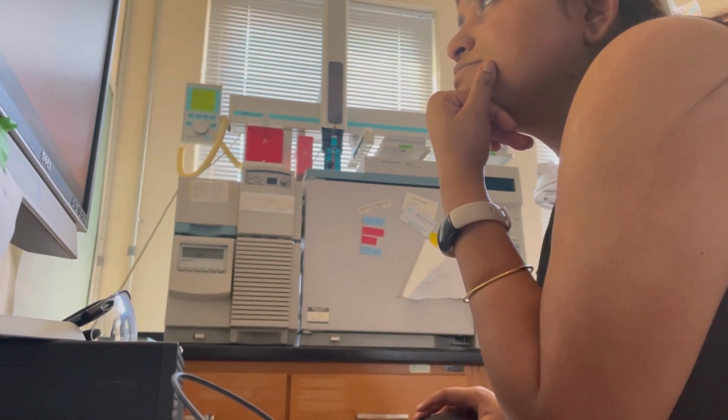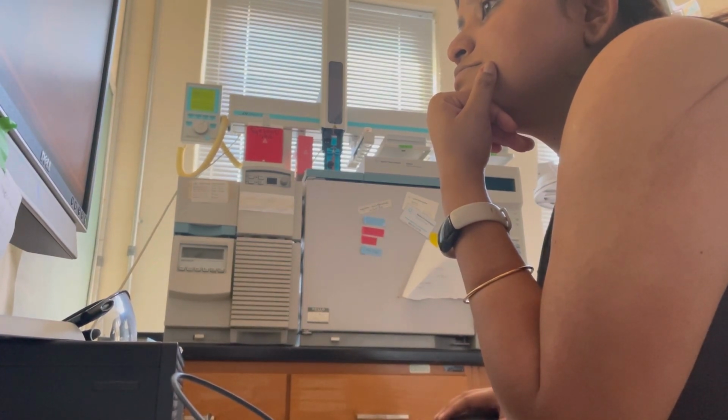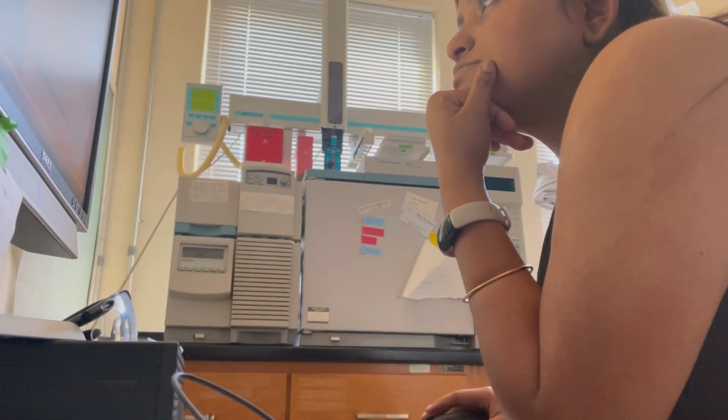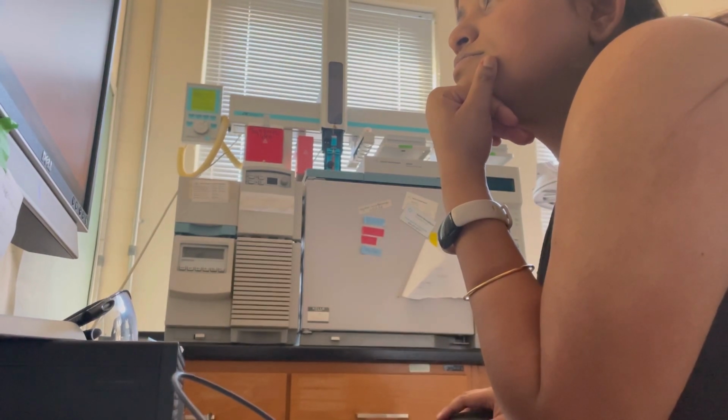I have been working with this sediment for some time now, and I remembered that I had done a bulk sediment analysis of the sediment last year, but I had run it on a different GC, and I wanted to look back at that data and see if the results were consistent.